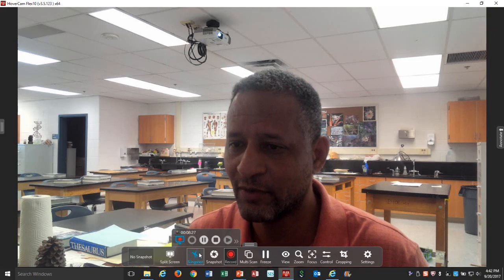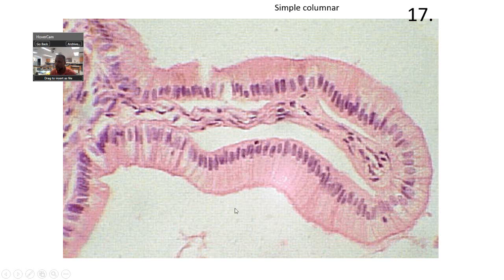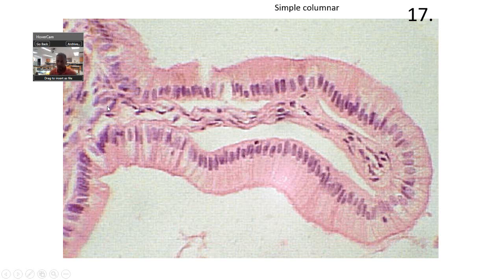So this is the lumen, and this right here is connective tissue with blood vessels. The food products being broken down are going to be diffusing across these membranes and getting into the lacteals, which connect to the bloodstream. That's how you absorb your food.